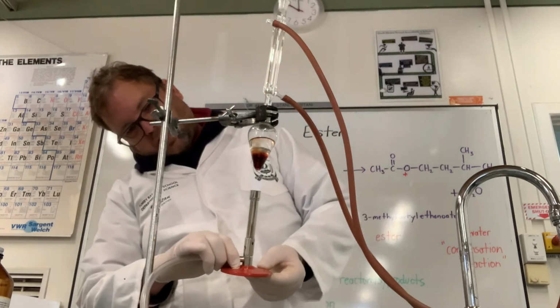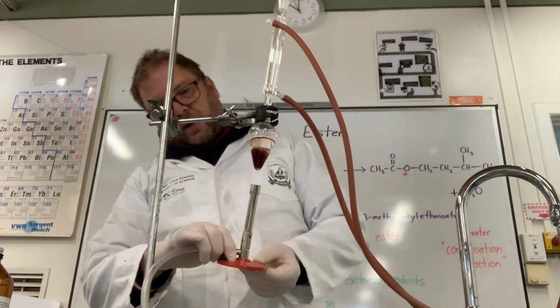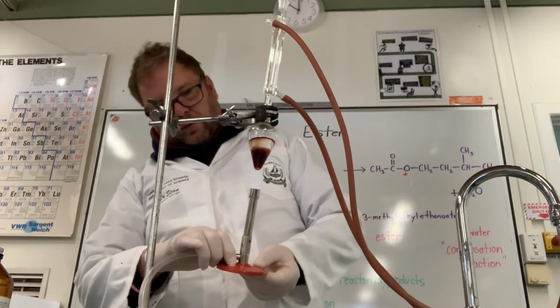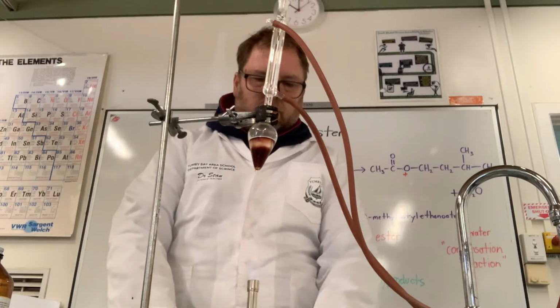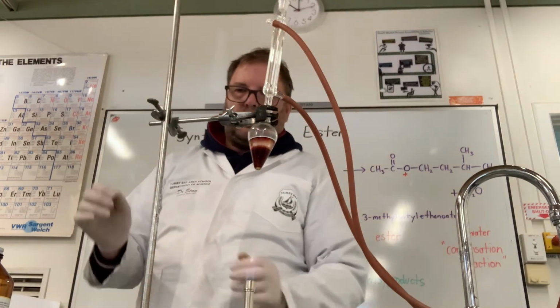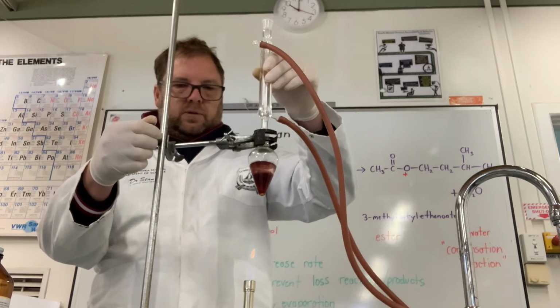Now the other thing I meant to show you before was that initially we just had that all as one layer. What you'll start to see in a minute, well, we'll talk about that later, but initially everything sort of mixed in together. That's boiling away reasonably nicely. Now what I'm going to do, so I don't have to hold that the whole time, because I've got quite a low powered Bunsen, which I don't really mind actually for this prep, because too much heat can be a problem.